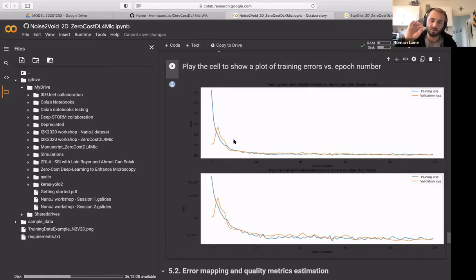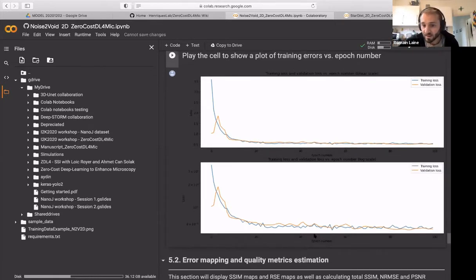That confirms to you that you've not overfitted and that it's converged towards a place that it's actually confident with. And the moment it starts plateauing right here is when the learning rate gets adjusted automatically. So it suddenly starts decreasing the learning rate and doing smaller and smaller steps. And that's why it only slowly converges towards something more sensible.